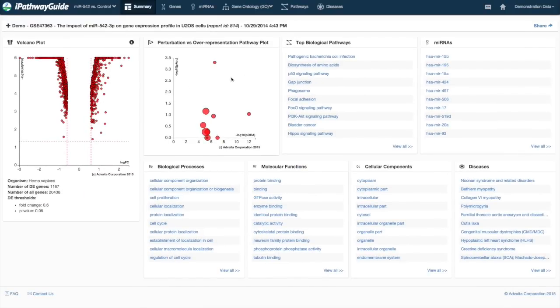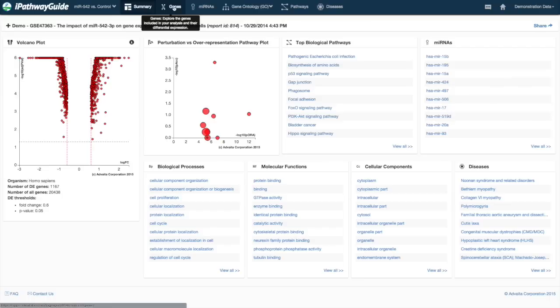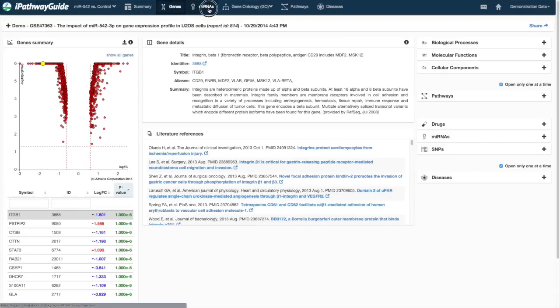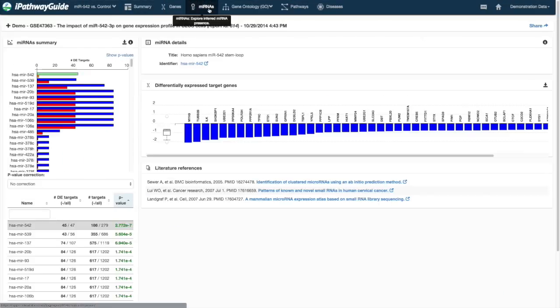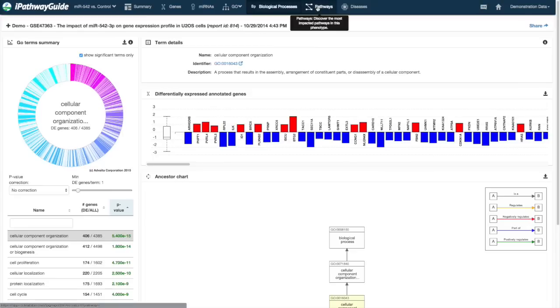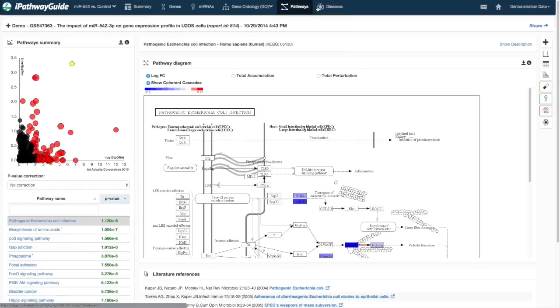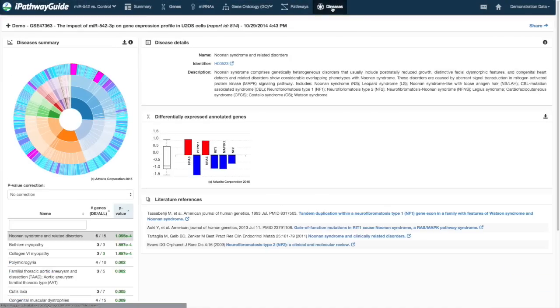iPathwayGuide is a cloud-based solution that takes gene expression data and provides deep biological insights for genes, predicted microRNAs, gene ontologies, pathways, and diseases.